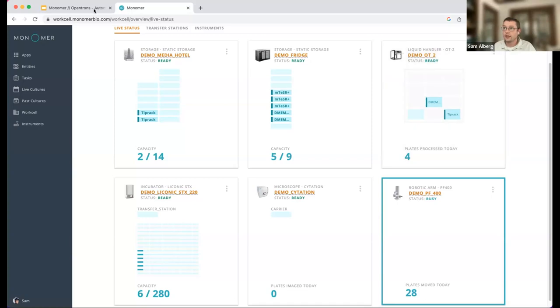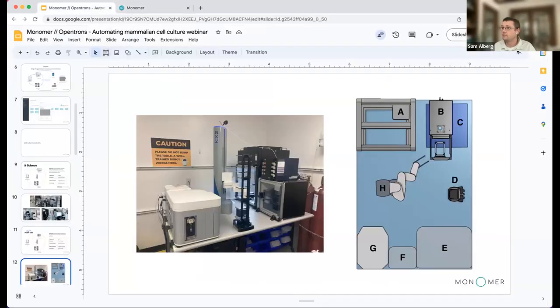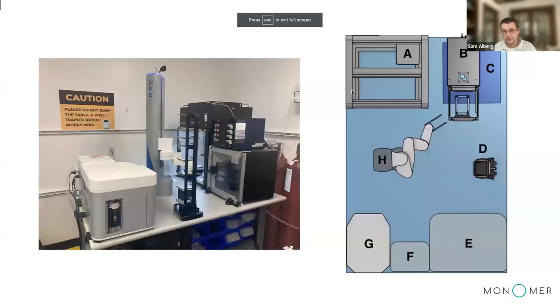So this is just a quick little preview of Monomer's execution software. We'll get into some more components of our software in a little bit. I'm now gonna just hand this to Carter, who's gonna go over just a few tips and tricks for building these work cells, and then we'll pause for questions.